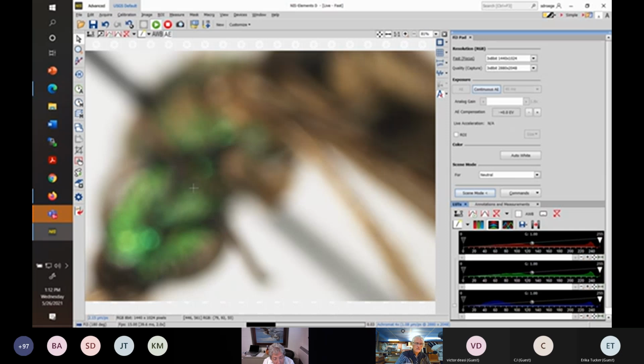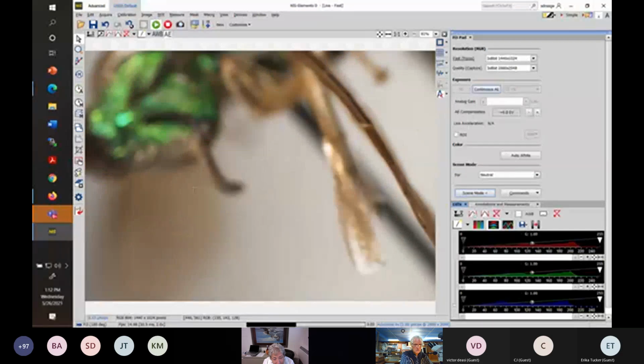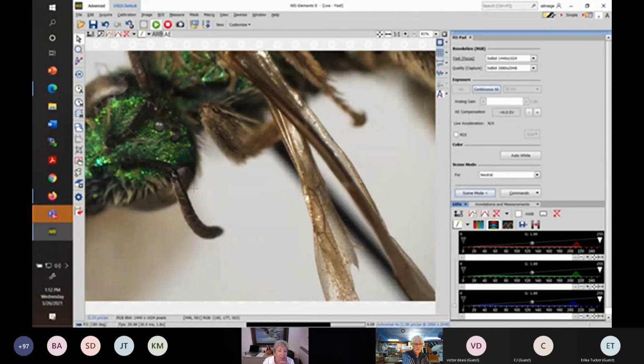female groups that you're going to run across commonly. The exception is Holcopasites, which is rare and uncommon. Both male and female have 12 segments.